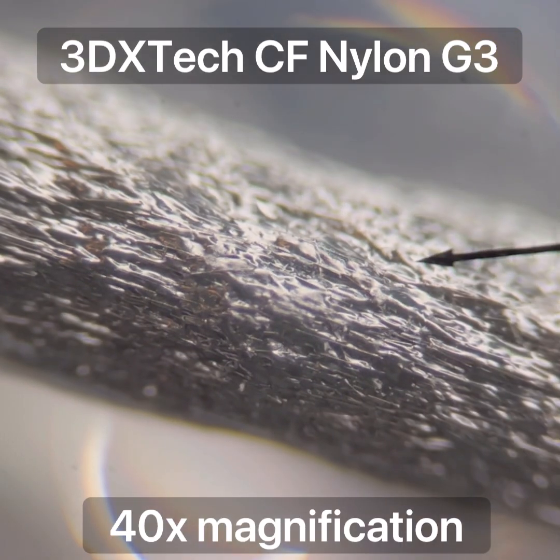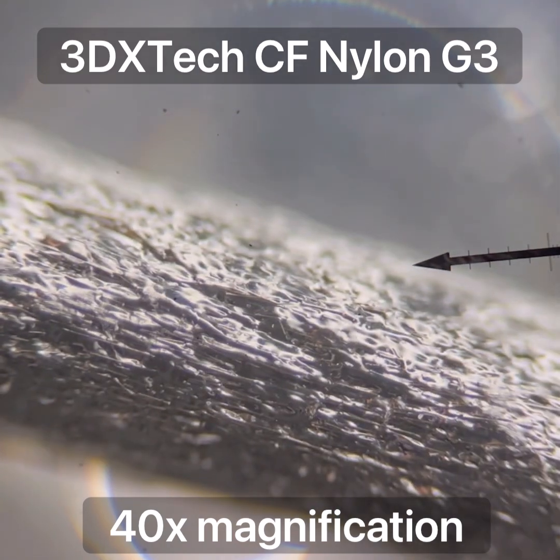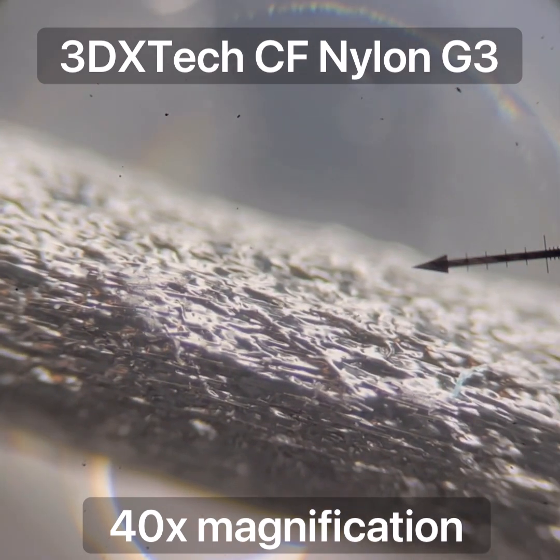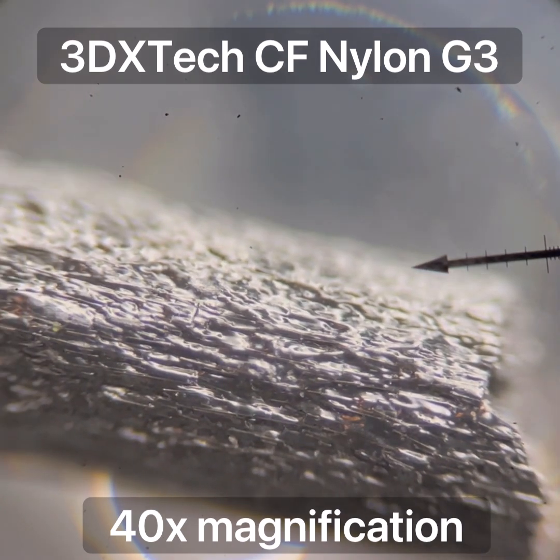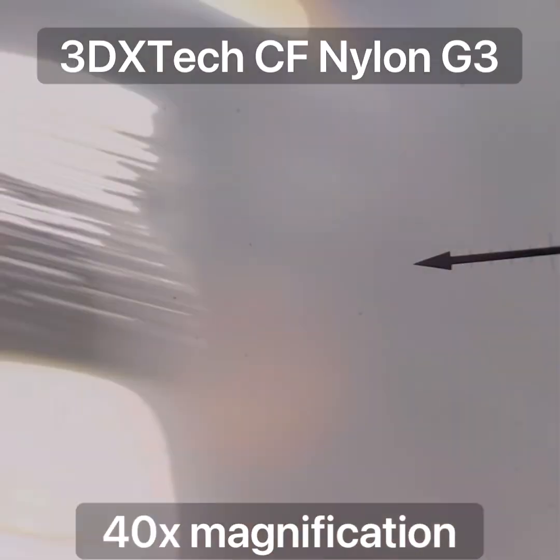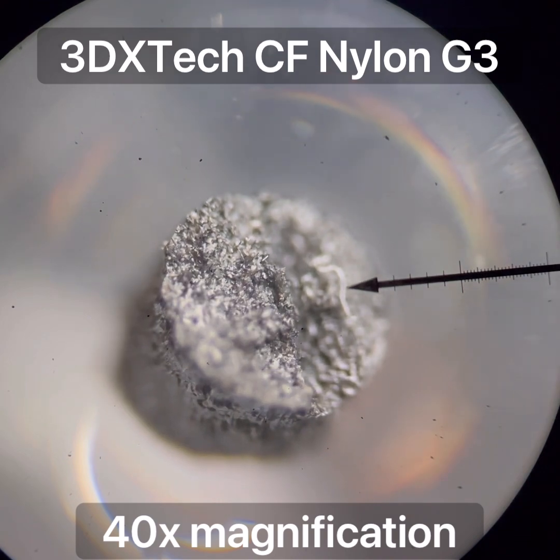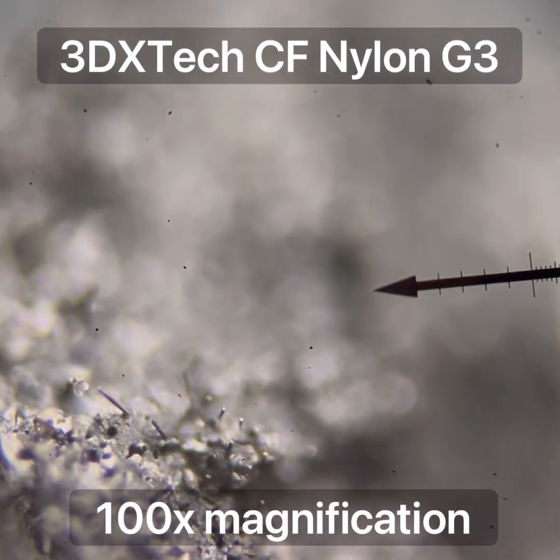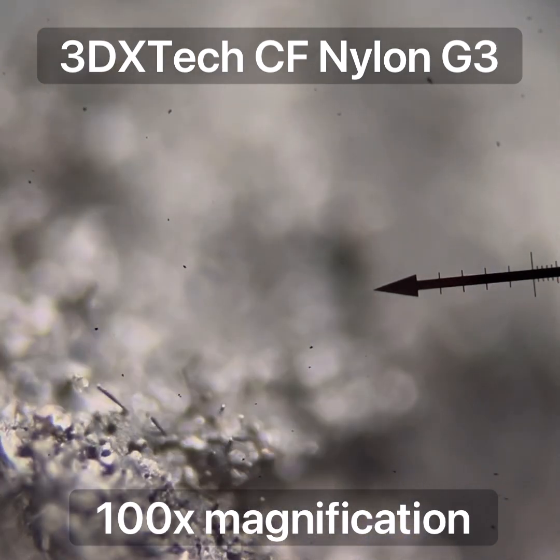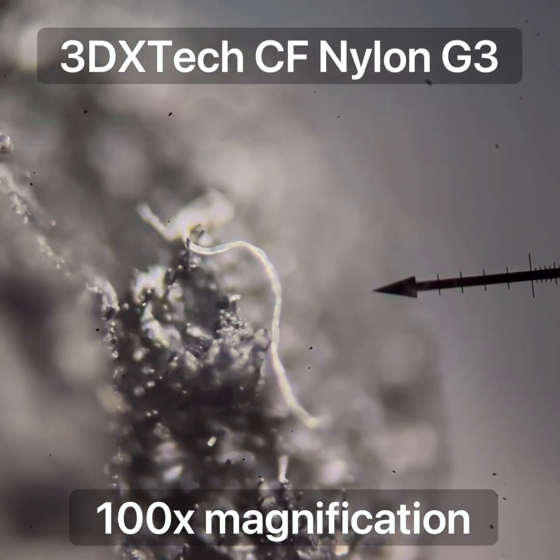The 3DX brand nylon carbon fiber - this is the Gen 3 regular nylon. You can see the carbon fibers used in this filament are much larger diameter and much longer than the other filaments we've looked at. These fibers are way bigger than the other brands, which is significantly contributing to the stiffness of this filament. Here is the end view of that 3DX brand carbon fiber nylon. We can see there are definitely a lot more fibers, all aligned in the direction of the filament compared to the other brands. The ratio is much higher - there's a lot more carbon fiber.